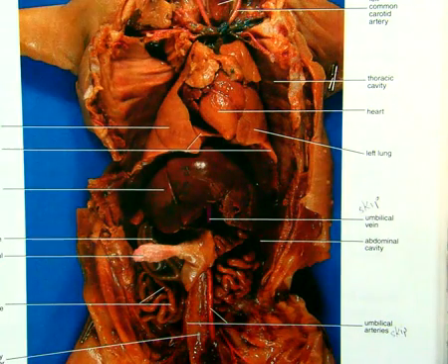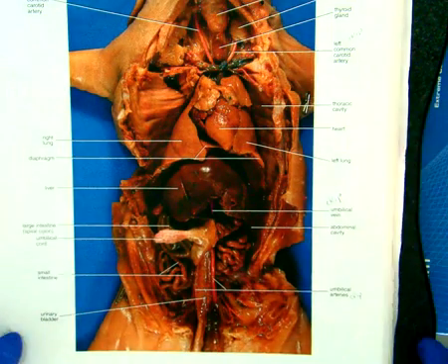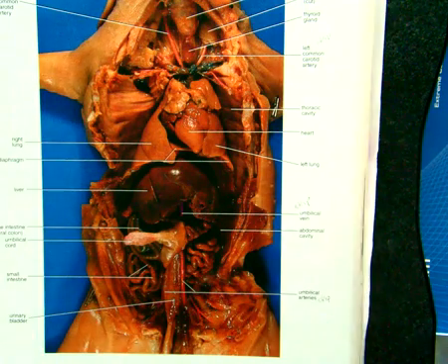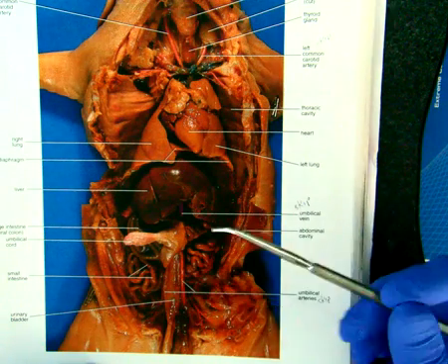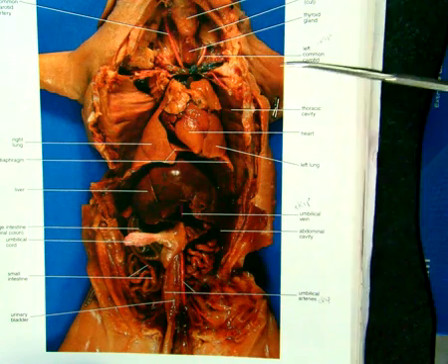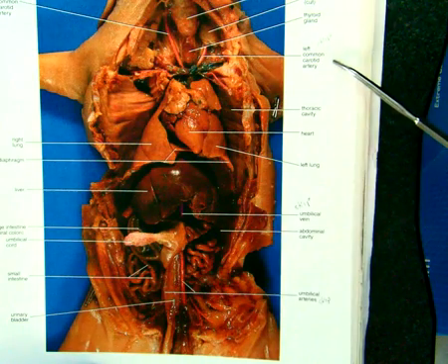All right, this image, and I'll zoom out just a little, is what it would look like from the cartoon. Again, I've given you a PDF of all this. So not quite as pretty as the cartoons, not as clear lines, but still, all of it should be evident, with the exception, again, we're not going to hold you to all the blood vessels that we have here. Okay, so on this it says skipping the umbilical arteries, veins, carotids.